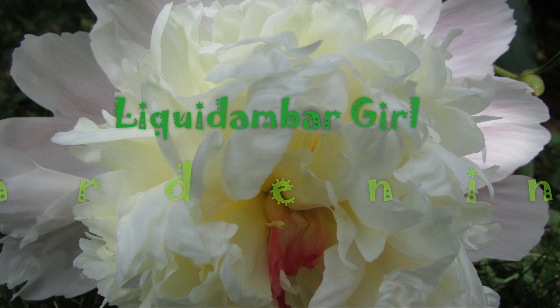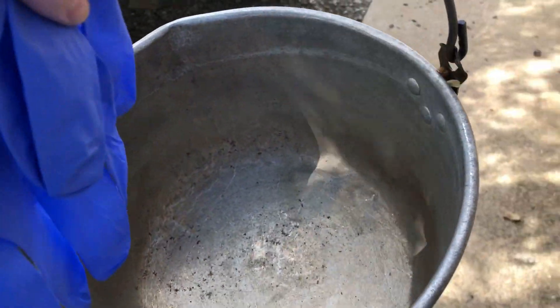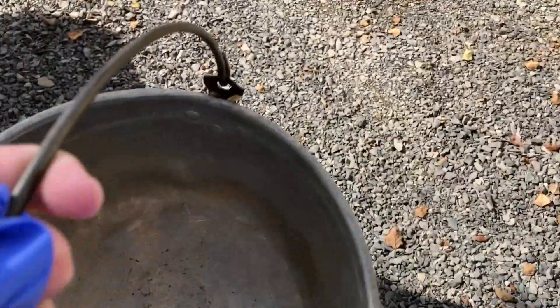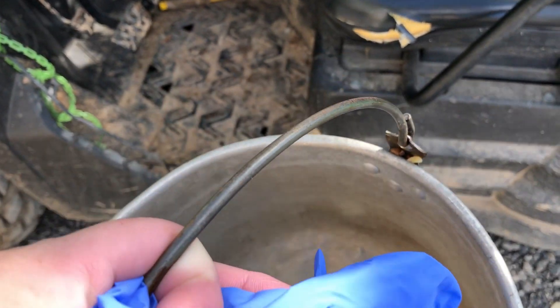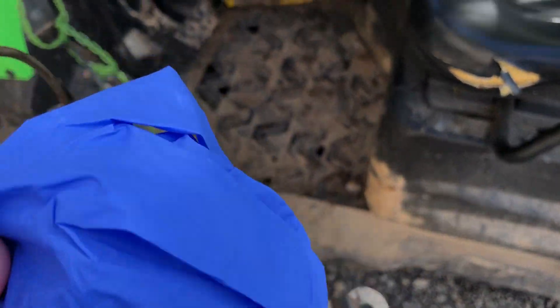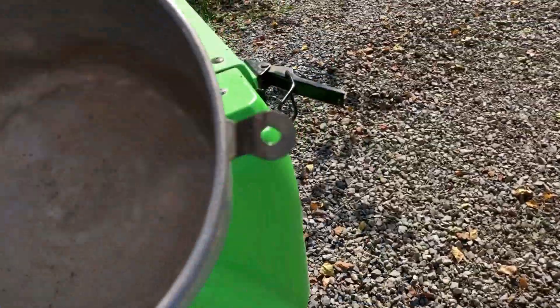I have a clean pan to collect grapes in. It's important that it's clean and doesn't have any water in it, so make sure it's properly dried. I have some nitrile gloves because the grapes are pretty sticky. We have some insects that are chewing holes in them and making a bit of a mess.